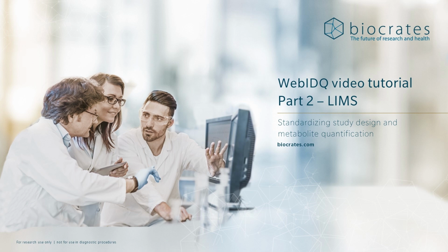This concludes the second part of the WebIDQ video tutorial series. In this section, we looked at how to register samples and make a project in LIMS before exporting it to the MS instrument. For additional details and information, please consult the WebIDQ user manual. In the next section, we'll look at how to import and quantify the raw data files in results.